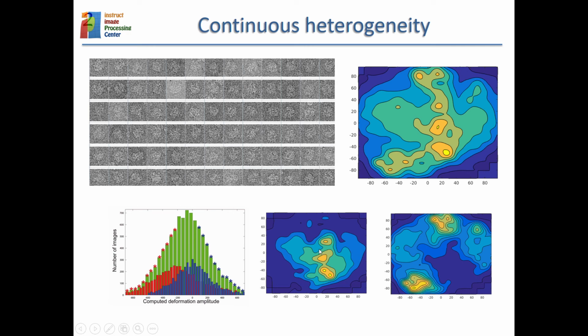And when you look at the continuous heterogeneity of that data set, and you make a plot in 2D, you project all that information into a 2D plane so that you are able to see. What is identified is that one of the classes was kind of the central core of this continuous heterogeneity, while the other class was just a mixture of the remaining. And in the remaining we had also a couple of subclasses that were not originally identified.